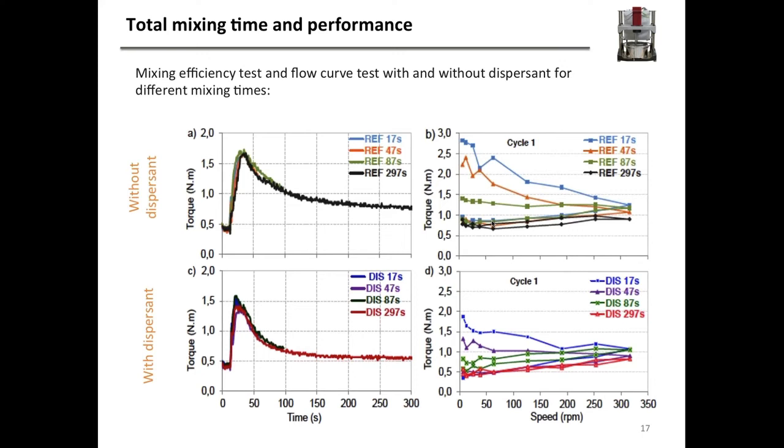So after it has settled for a while, you take it, and in the rheometer, so it's still in the rheometer, you ramp up the rotation speed little by little. You make several measurement points as you ramp up, and you measure the torque at the same time until you get to a speed of about 300 RPM. And as you're there at 300 RPM, you go back down. You go back to 250, 200, 125, etc., and you measure the torque.